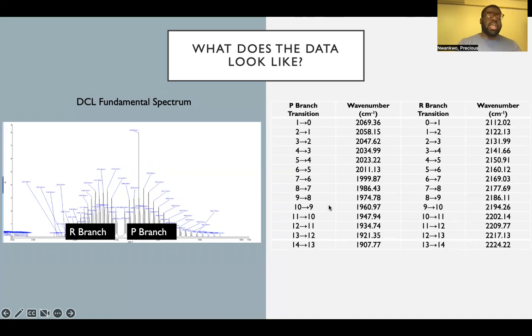And I'm sure you're looking at this thinking, okay, just putting them into a sheet, what can we really use with them? You'll see that later the numbers will eventually be used to create a graph, and these graphs will then be fit to a line of best fit using a third order polynomial. That third order polynomial will then allow us to analyze the data to get certain vibrational constants that we can use to understand the differences between the two. The vibrational constant that we're looking out for is the force/spring constant that I was speaking about earlier, which is denoted by K.